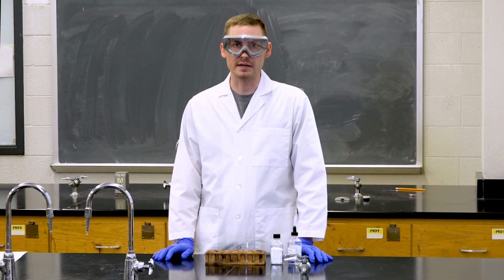That concludes experiment 5, physiologically important ions, and how we can test for them using qualitative chemistry. If you need any additional assistance in your lab, please feel free to ask your TA and they'll be more than happy to help you.